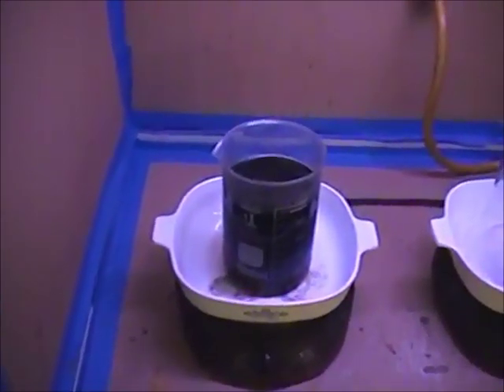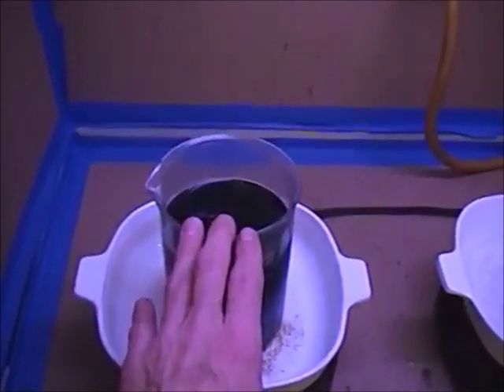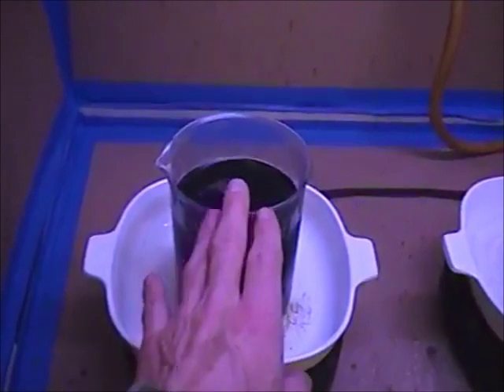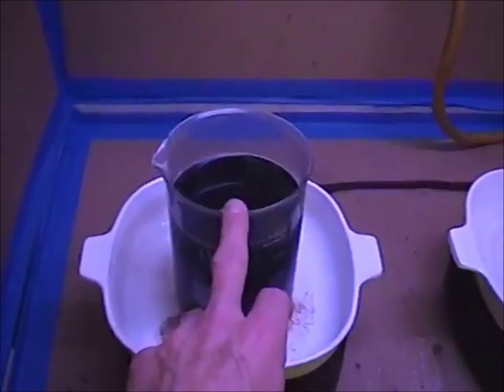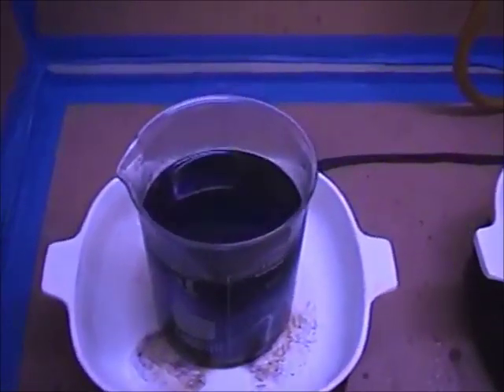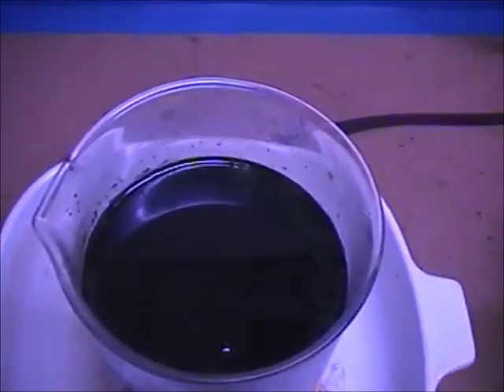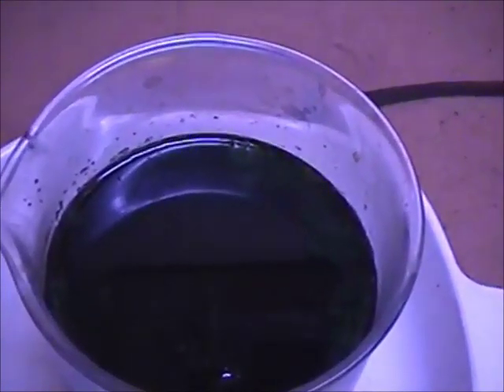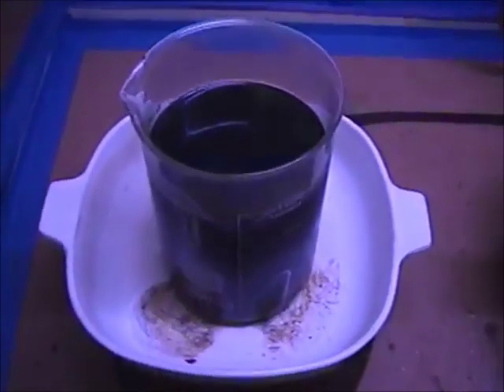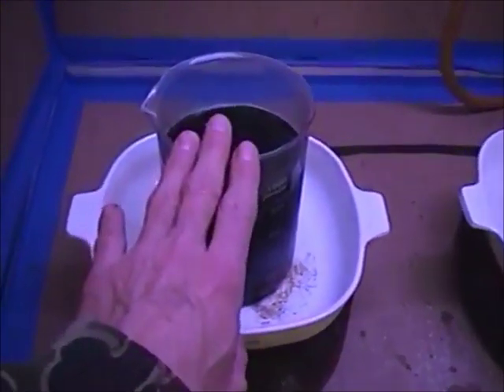And it's been a couple of weeks since I finished this up. Once I dissolved all my materials from the first video, I filtered this, and it has been sitting in a beaker for about 2 or 3 weeks. On the very top, I noticed that I had this spongy mass form. There's not a lot of it, and I set it back on the hot plate because I wanted to warm it up to see if any of that would go back into solution.